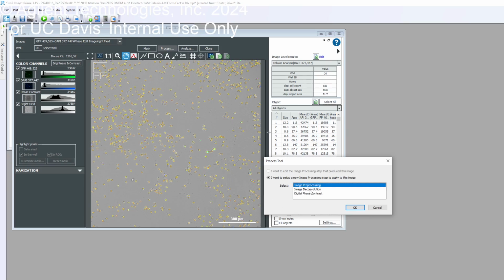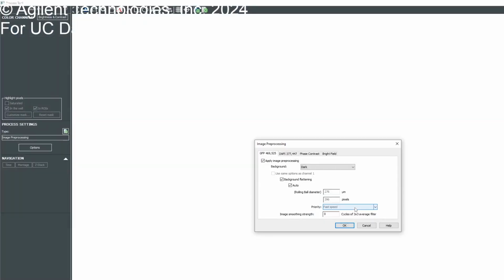Double click. Oh yeah, what's this deconvolution? It's only good for very high magnification, like 20, 40x images. This is a wide field system, so it will have its imperfections. This is just a digital algorithm to sharpen the image, and it's going to apply some pixel smoothing and blurring depending on how your image looks. It's also very commonly used in ImageJ, so this is just a much more refined version of that. It's just the pre-built, but you don't really need that for what you're doing. If you go to like 40, 60x, then you might be able to use that nicely.